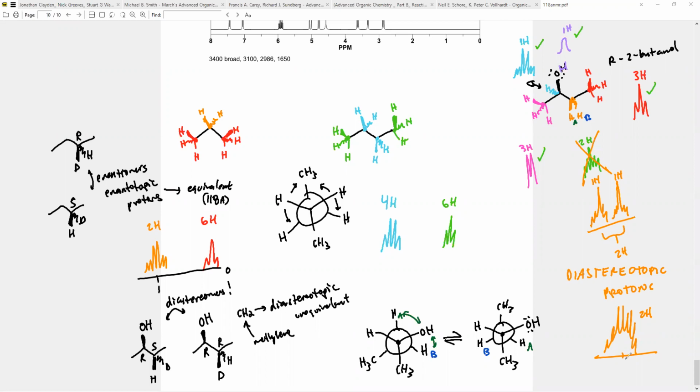Luckily for us, professors usually use ChemDraw to make their NMR, so it will predict a really nice, clean spectrum, even if in real life it's not that clean. ChemDraw as a computer is going to use the best possible magnet, your computer magnet. So that's why sometimes you might hear from others, or see online, that for linear molecules that can rotate, diastereotopic protons aren't a big deal, but we still do see complex splitting. We'll come back to complex splitting in a bit.